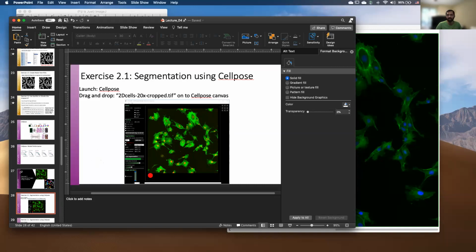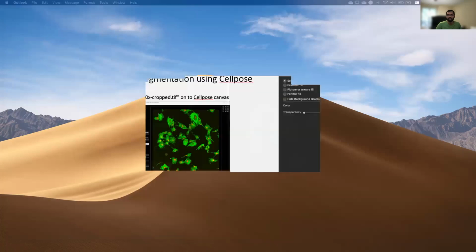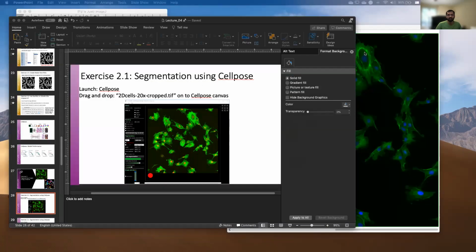So let me go back to the email and follow up on the instructions that I sent you earlier. So the first step I want to do is open my terminal.